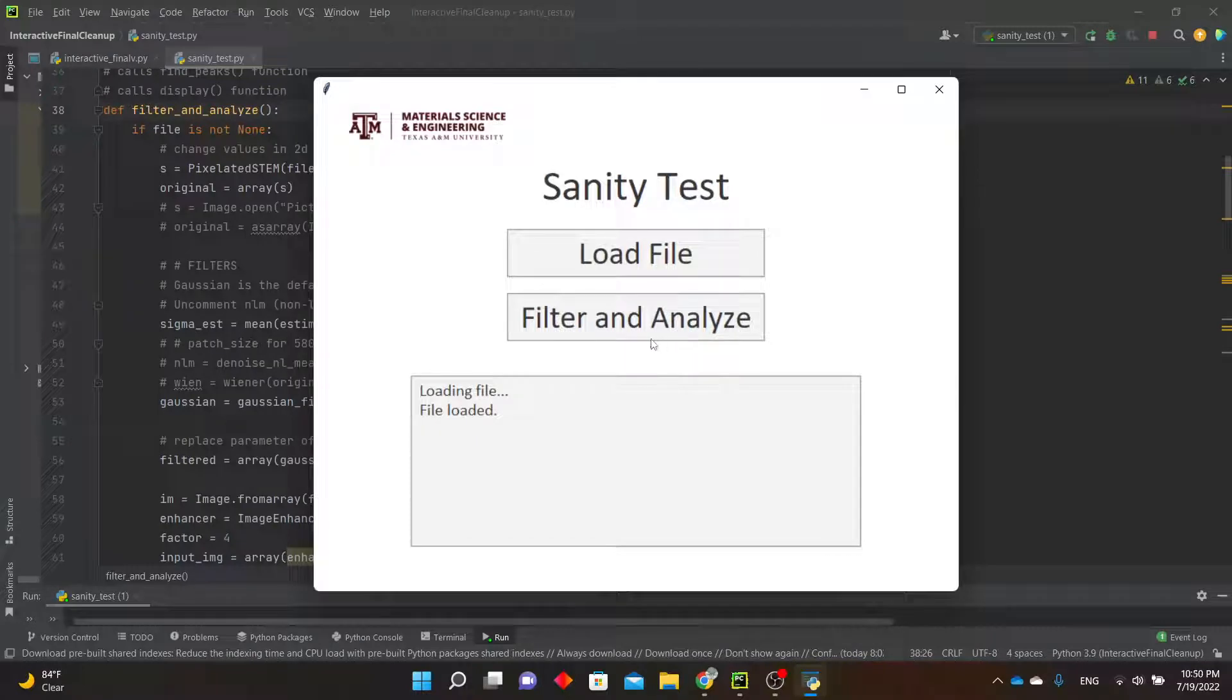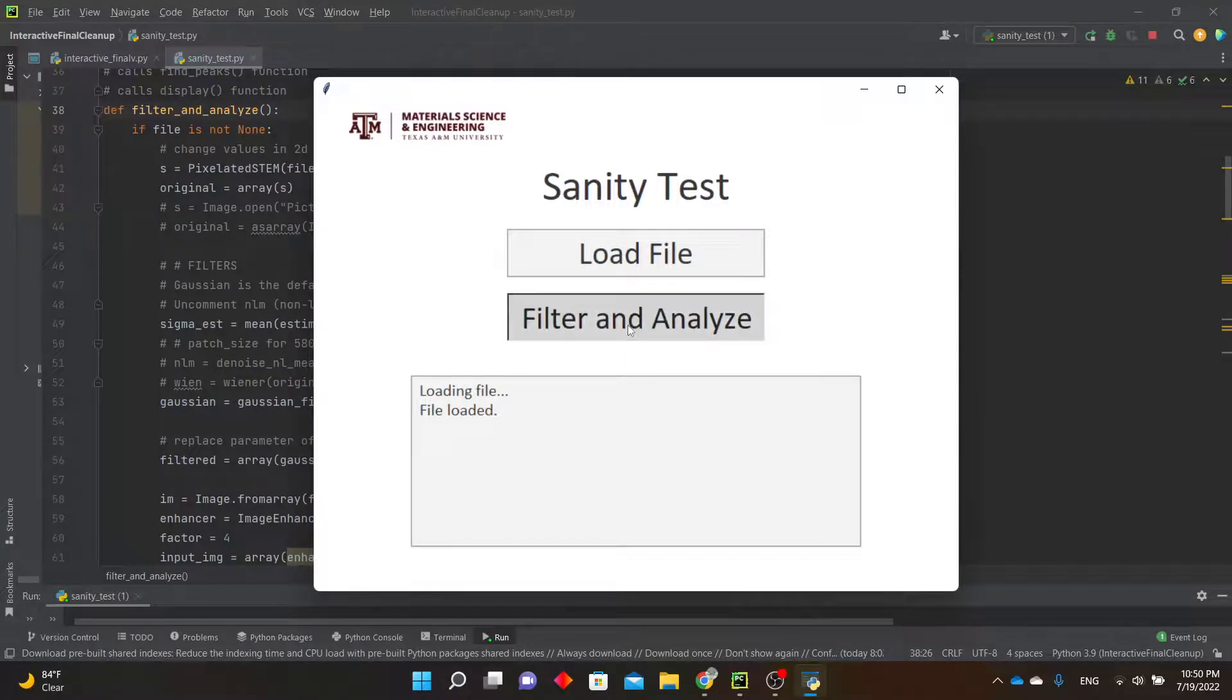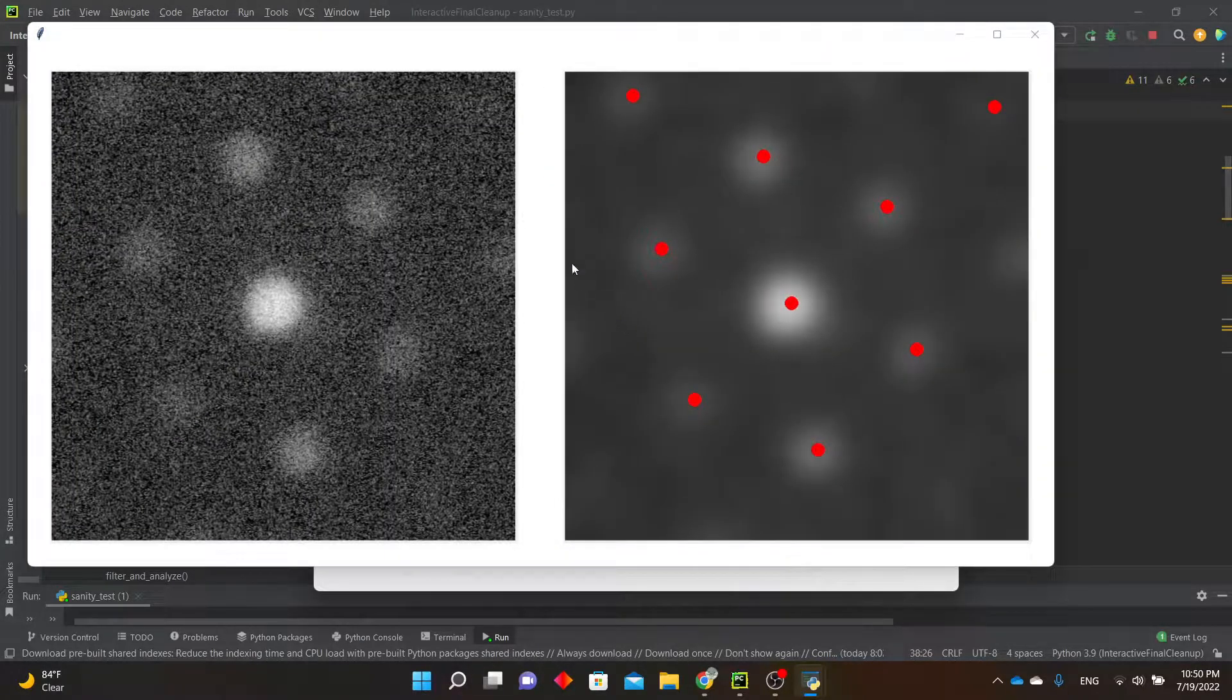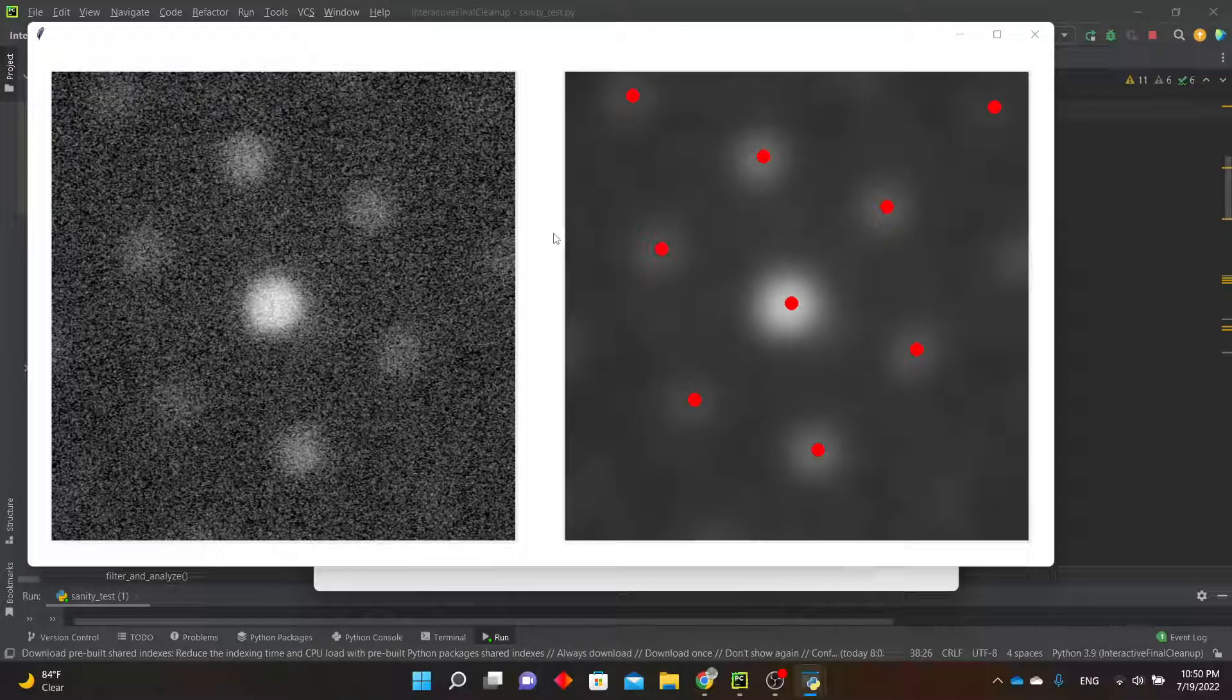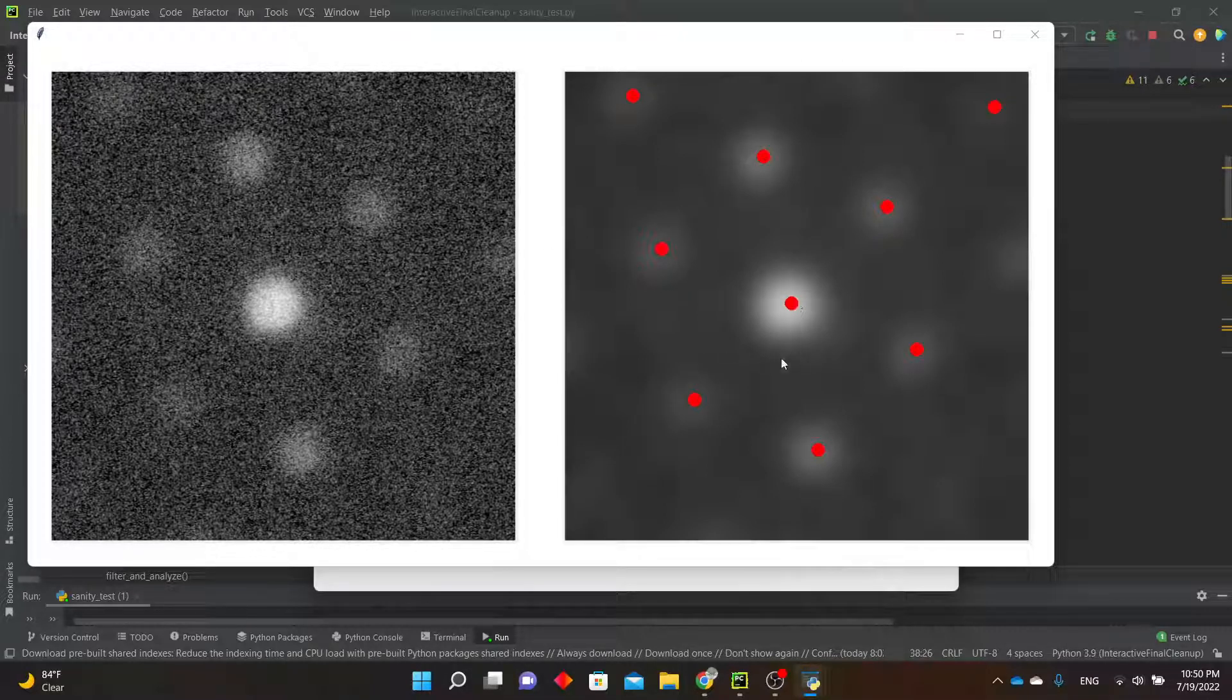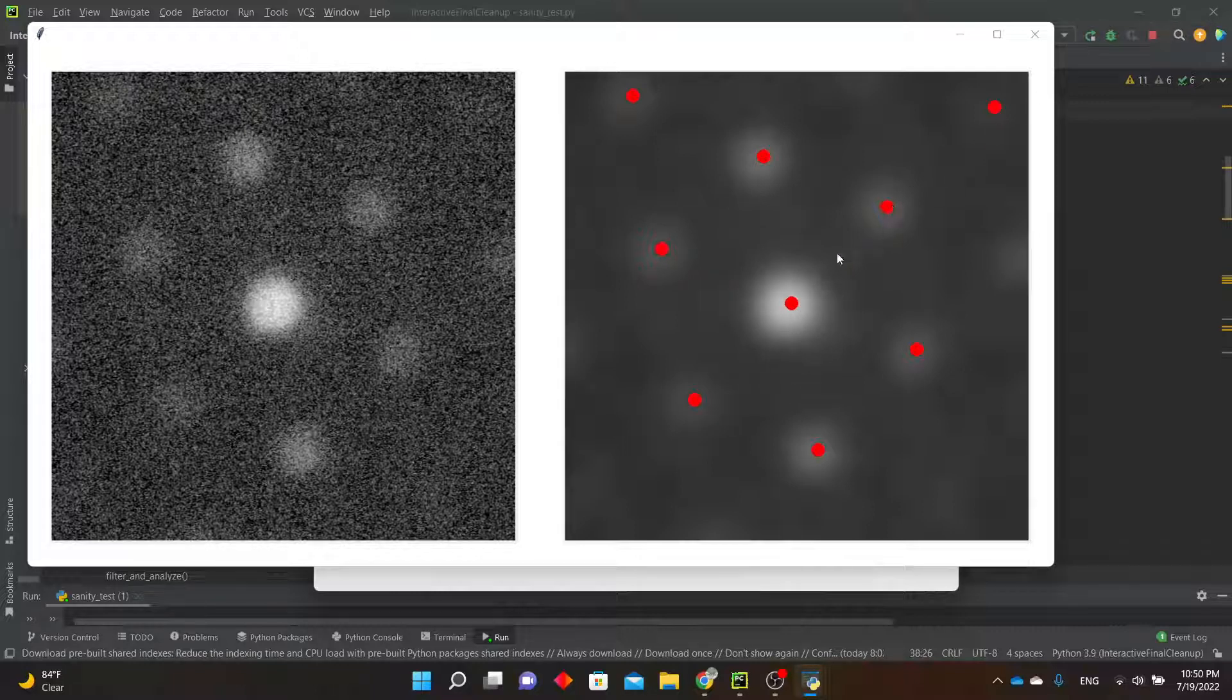Then, when you click the Filter and Analyze button, a new window will pop up displaying one of the diffraction patterns from the block file. On the left side is the original image, and on the right side is the same image with the filter applied for denoising, and it has all of the recognized diffraction spots marked with a red dot.